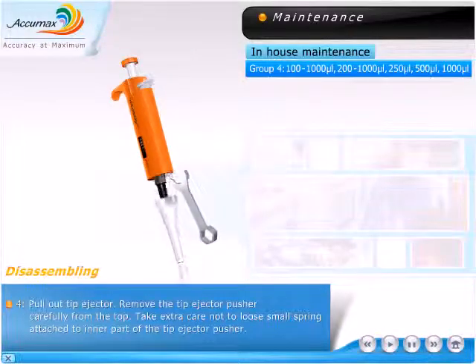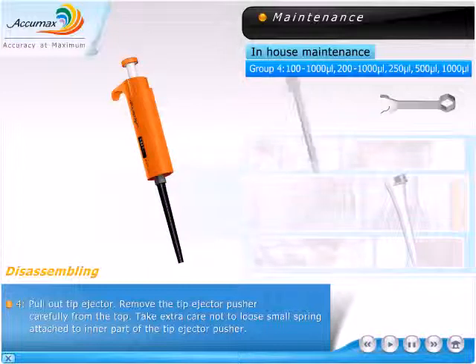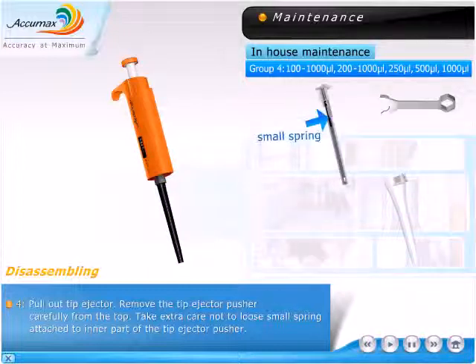Pull out the tip ejector. Remove the tip ejector pusher carefully from the top. Take extra care not to lose the small spring attached to the inner part of the tip ejector pusher.